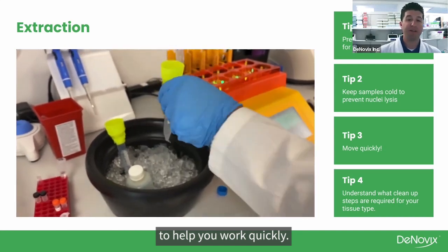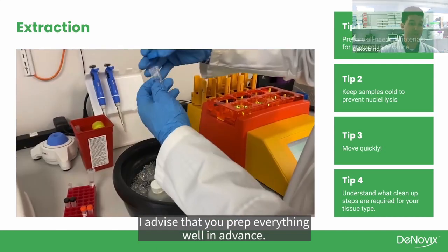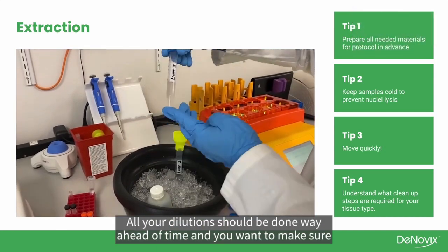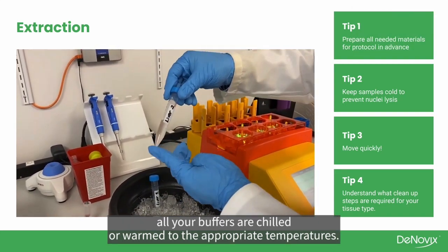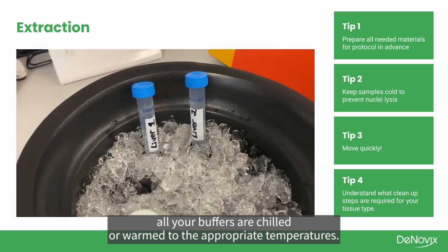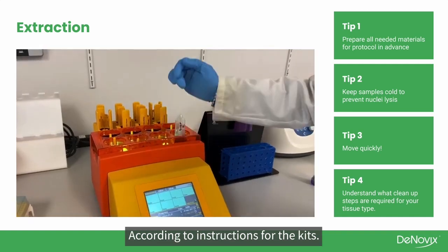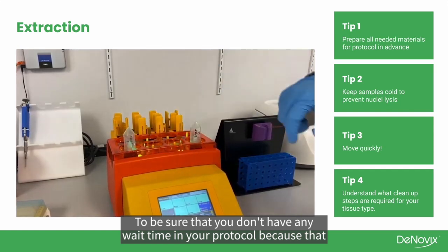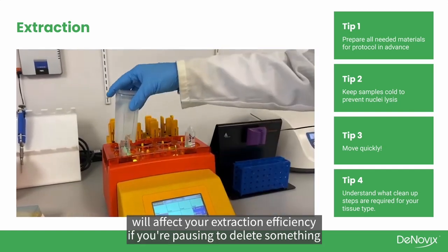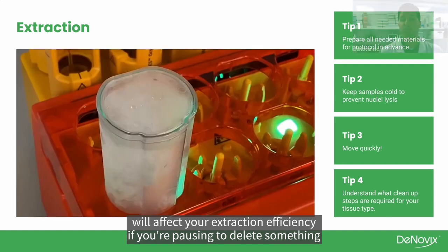To help you work quickly, I advise that you prep everything well in advance. All your dilutions should be done way ahead of time, and you want to make sure all your buffers are chilled or warmed to the appropriate temperatures according to the instructions for the kit, to be sure that you don't have any wait time in your protocol, because that will affect your extraction efficiency if you're pausing to dilute something.